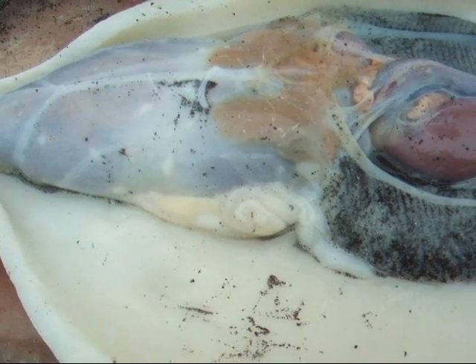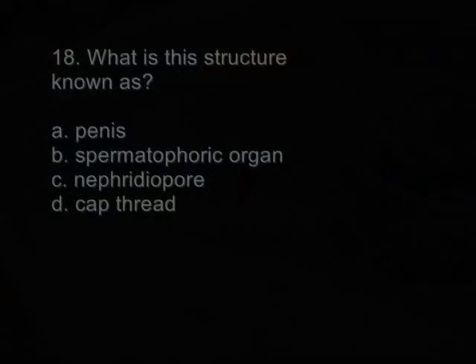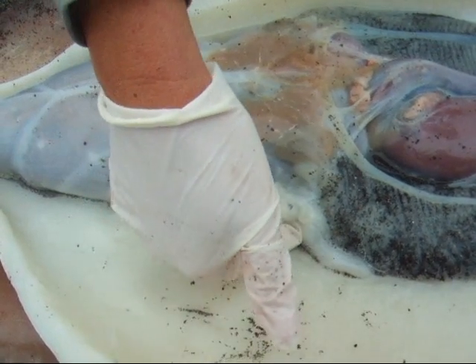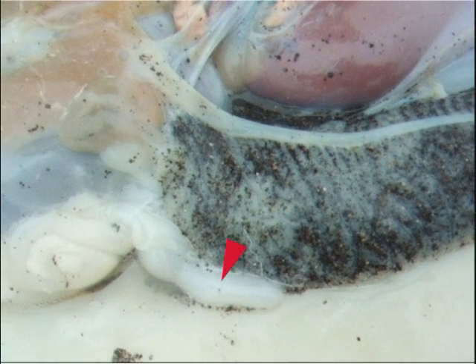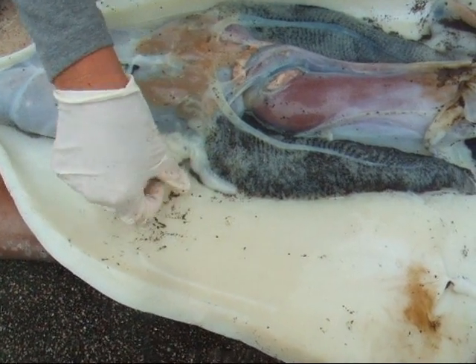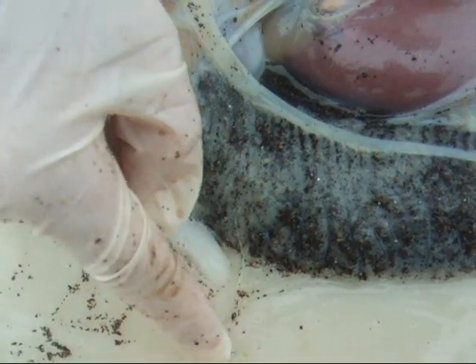What is this entire structure called? Sperm leaves this structure through this structure — what is this structure called? There are hair-like projections on the end of this structure to aid the sperm, though they're kind of hard to see.